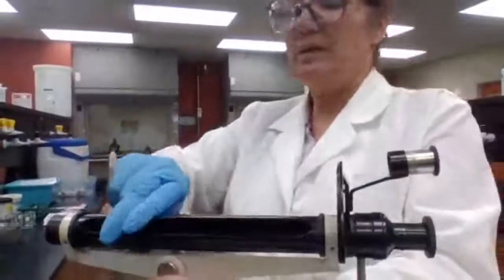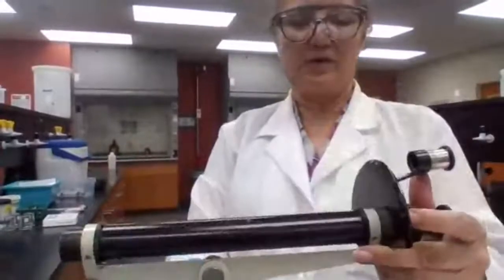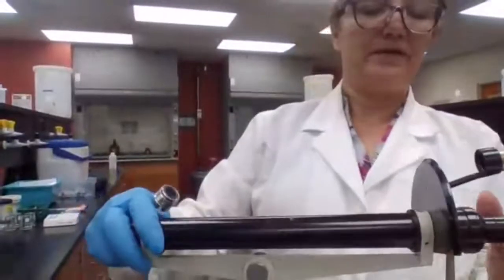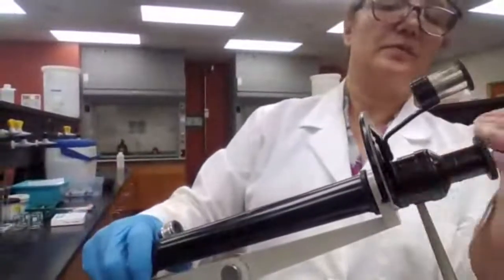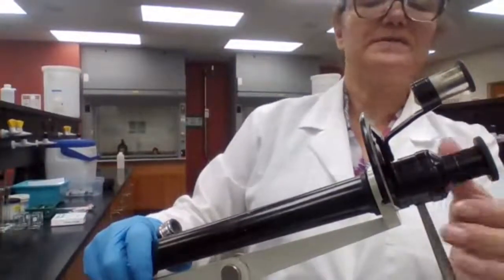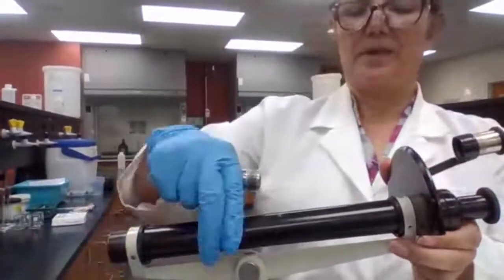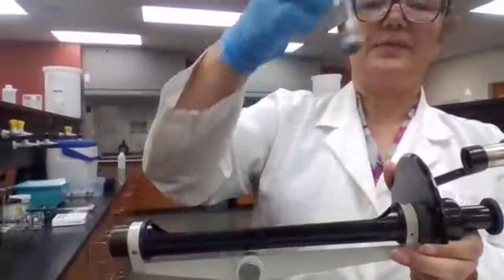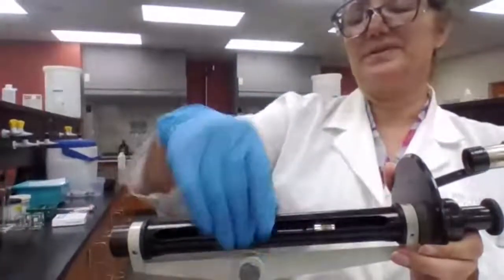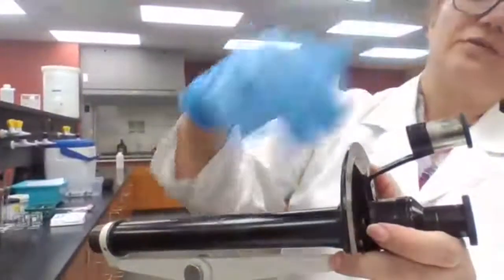when we turn this on, it's missing some attachments, which I'm going to get. And when we turn this on, there is a filter on this end and a movable filter on my view, where I have the magnifying glass and the eyepiece. The light is going to come from this end. It will pass through the sample holder. If I place my sample in the tube, and place it in the sample cell, I close the cap here. Then I look through the eyepiece using the magnifying glass.